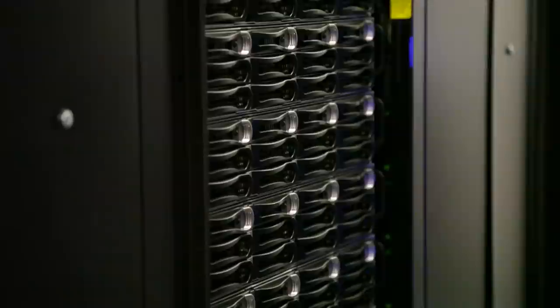These techniques generate huge amounts of data. The microscopes we have here can generate up to 600 megabytes of data per second. So you can easily fill a hard disk, an entire hard disk in a few minutes. So we're dealing with big data here and processing and storing it is an enormous problem.